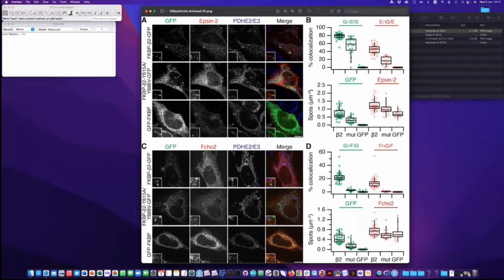But for people who can see all three colors, in this merge, particularly when we've got three channels, green and red make yellow, red and blue make magenta, and blue and green make a kind of cyan color, and then all three channels together make white. So that's the reason we do it in red, green, blue. We can look at where we've got these complex overlays of three different channels, and we can see them the way they come together with different colors. Okay, so basically that's what the finished product looks like.